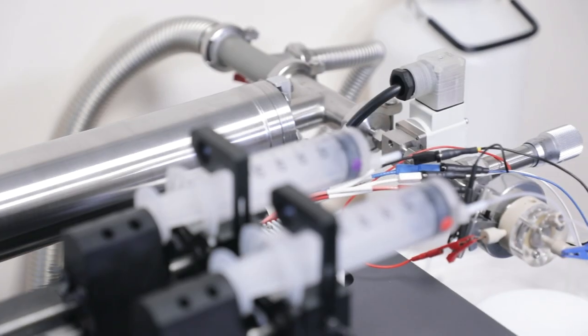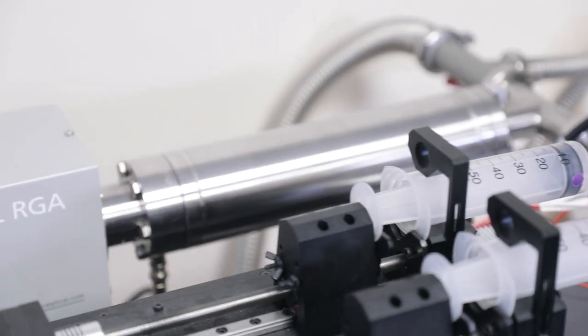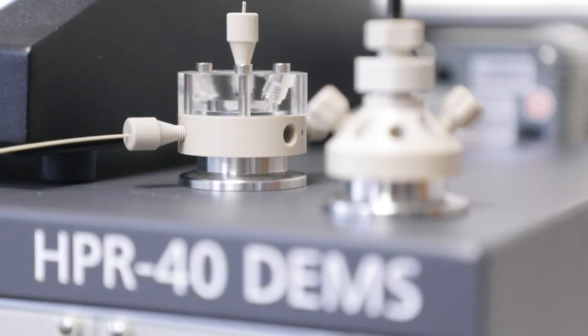The Heiden HPR40 DEMS is a modular analysis system, which can be used on a benchtop or mounted on a mobile cart.